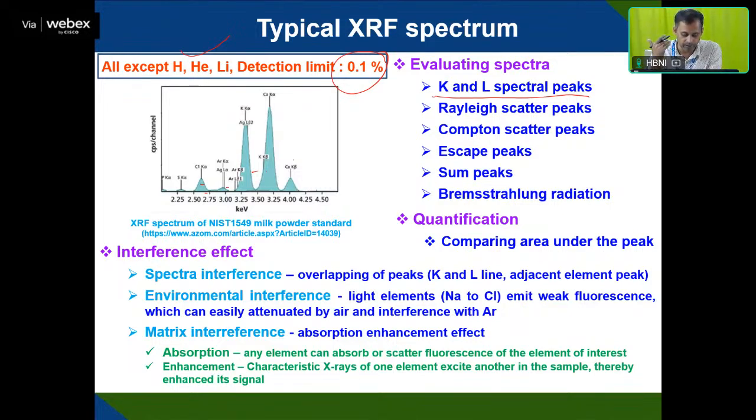In addition, absorption or enhancement effects can take place due to matrix interference. Isotopic differentiation is also a little bit difficult in this.